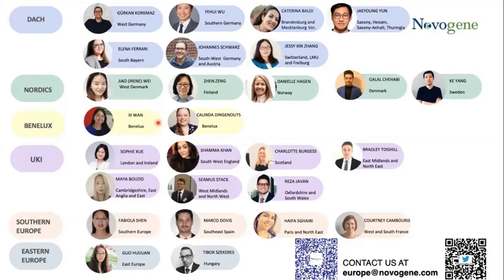I apologize in advance if I've mispronounced your name. Ayal Waghe has asked, in eukaryotes for mRNA sequencing, which sequencing method is more adaptive, NGS or PacBio? For messenger RNA sequencing, the different platforms simply serve different needs. For NGS, the RNA will be fragmented and we won't sequence the full-length RNA. For PacBio, what we do is called Iso-Seq. Iso-Seq can be used to study isoforms and other purposes, and also to study the structure. So based on your different research needs, you will choose a different platform. If your concern is only differential gene expression, NGS is actually enough for your research need. So it depends on the different needs.